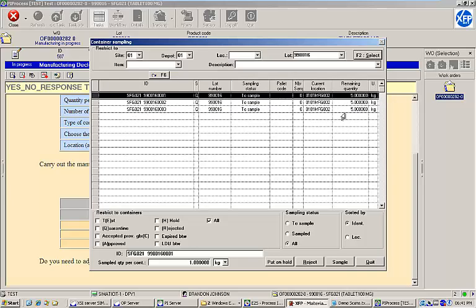But since we don't live in a perfect world, let's assume that we didn't produce a perfect batch. What if one of our containers actually only contains three kilograms of material? To account for this, let's choose to adjust our declared quantity.